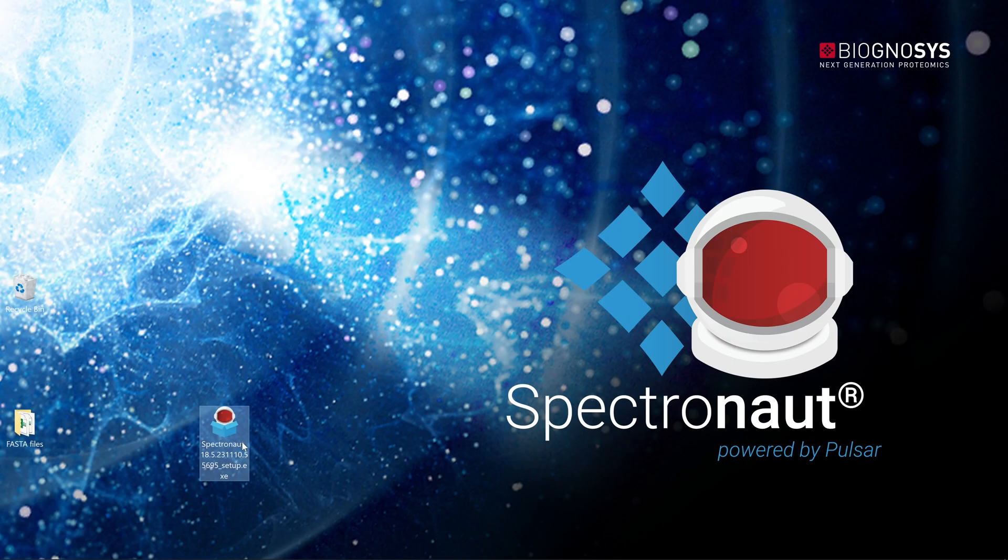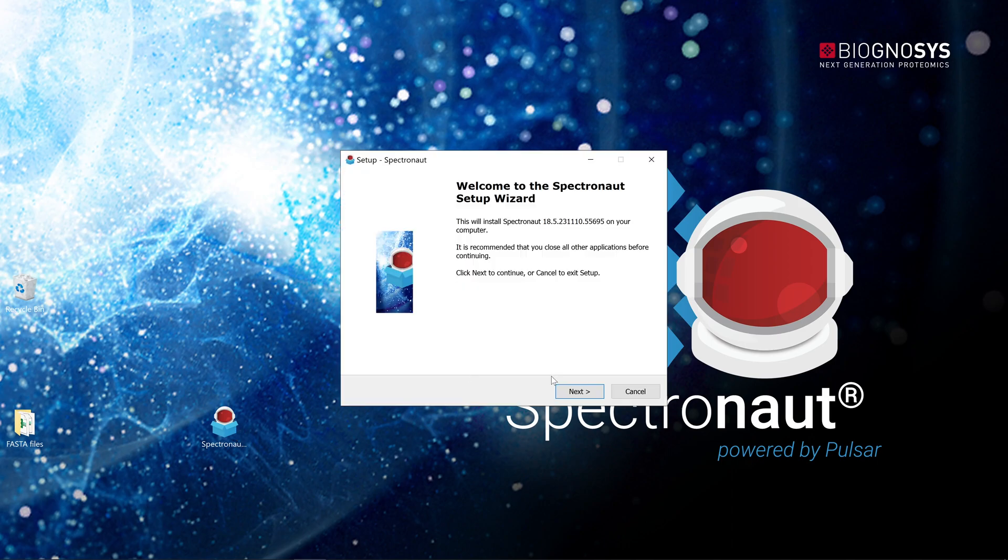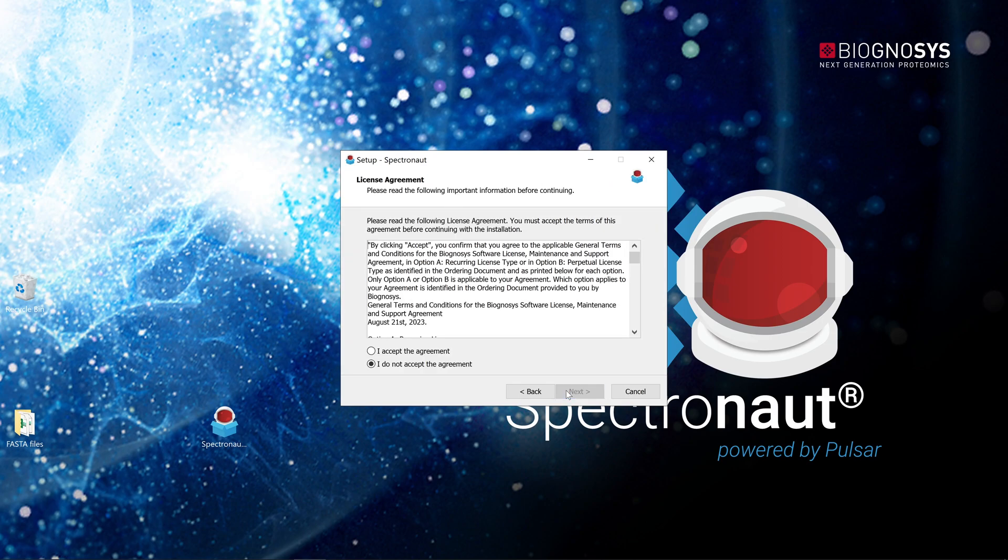Click on the installation link received from our product team. The installer should download automatically. Execute software installation. The wizard then guides you through the installation steps.